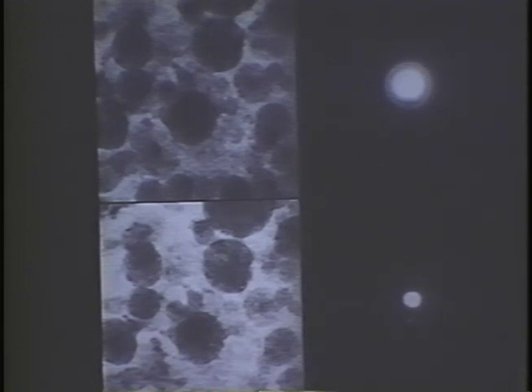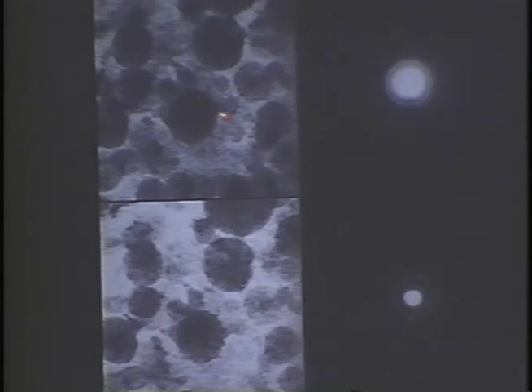Another important aspect of cryoimaging frozen samples is documenting the state of the ice using electron diffraction in the affected area. The top two panels show a thick organelle-rich region of a frozen hydrated cell and its corresponding electron diffraction pattern. This is taken at a cold stage temperature of minus 150 degrees.